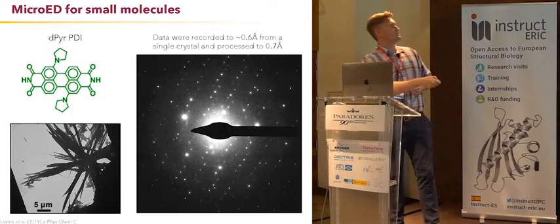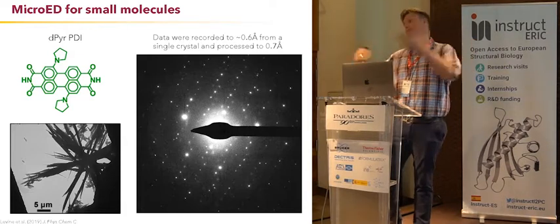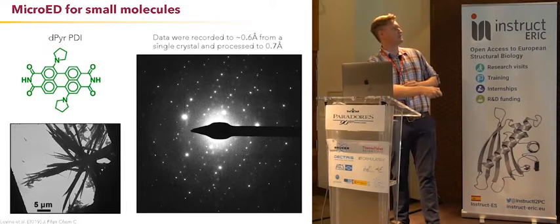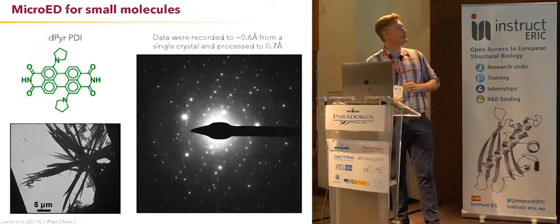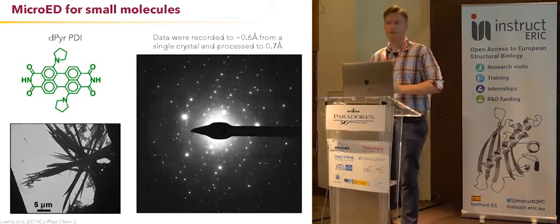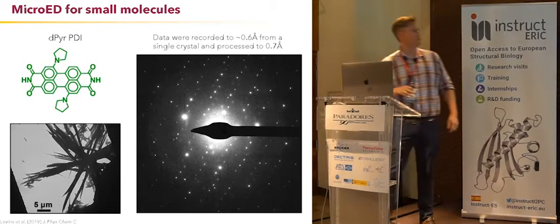So here was their first compound. This would be compound A that they then would mix with compound B, and they'd make this new supermolecular compound. You can see here it makes tons of these little crystals all over the grid. We actually collect data from things that look more like this right here, this little thing that you probably would just ignore. That's what we shoot at. And you can see it gives you a diffraction pattern that looks like this.